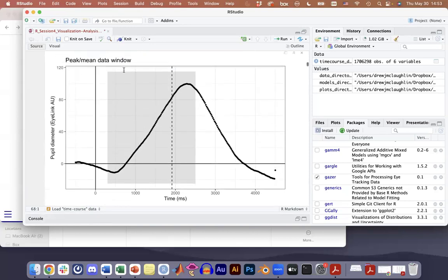This isn't to say we are cutting off our data if it goes above 120. That is just for drawing the box. We will be cutting off our data only along this x-axis. For example, when we get to the growth curve section, this is the window we selected, and the reason will be because that makes a very nice polynomial basis shape.